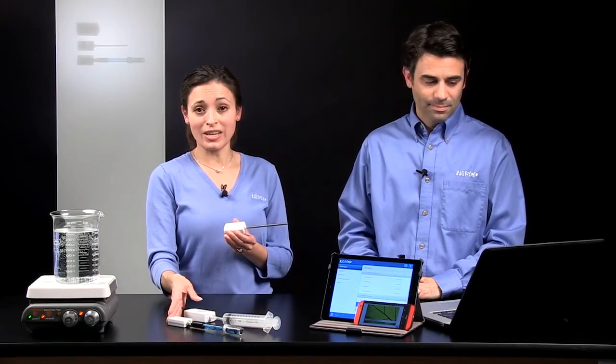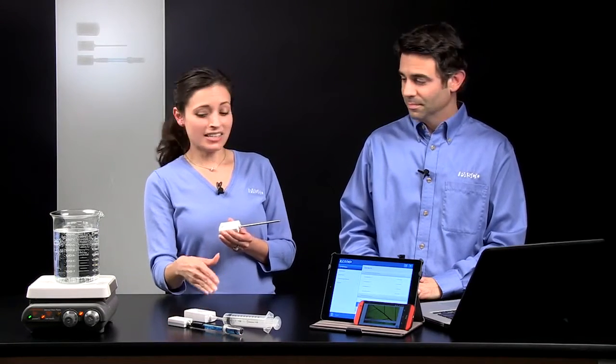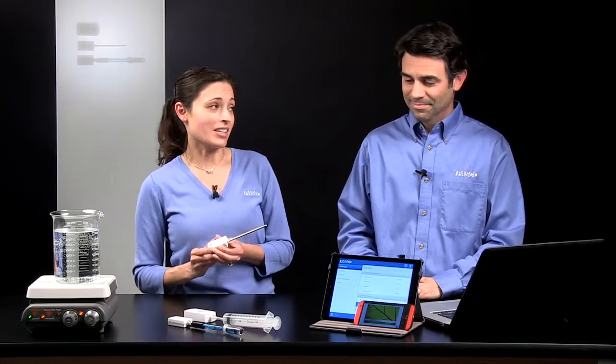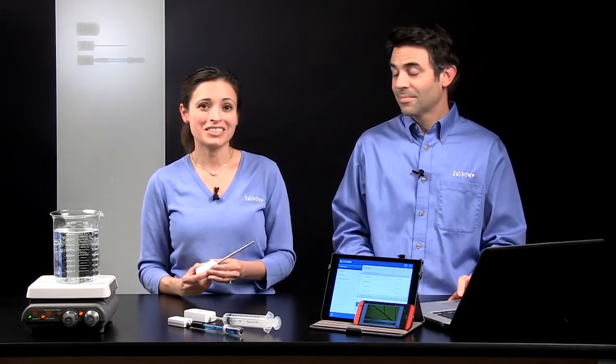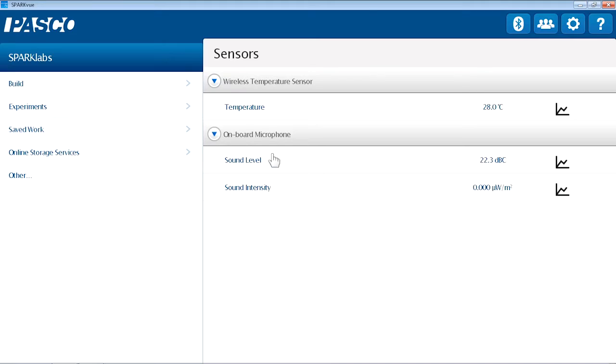While the other sensors are flashing red, they have not been connected. And they will eventually turn themselves off if they do not connect, keeping the battery life long. Right. So on this home screen, now that I'm connected, the temperature measurement is available.